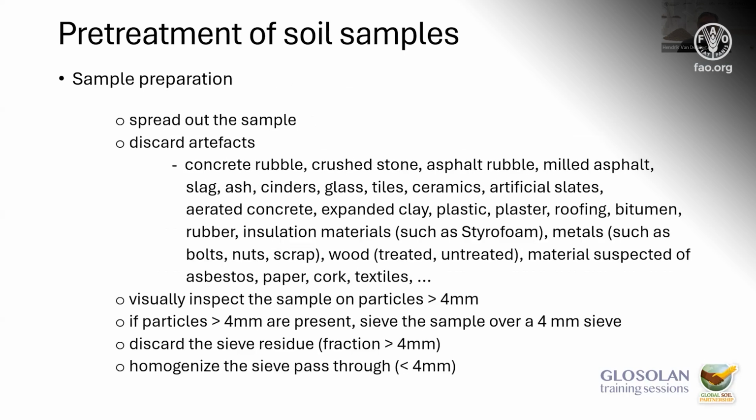So what do we do next when the sample arrives in the laboratory? First, we spread out the sample and we discard all the artifacts. I have here a list of artifacts like concrete rubble, crushed stone, asphalt rubble. So everything that has nothing to do with soil, artifacts.